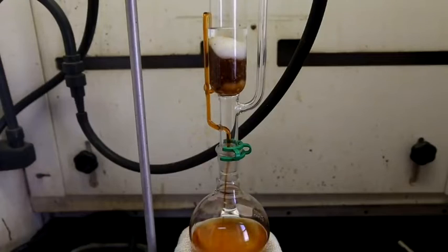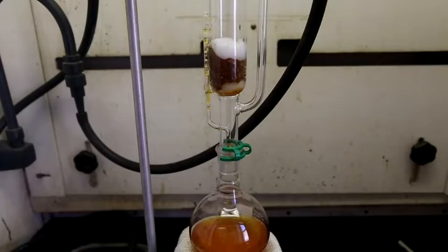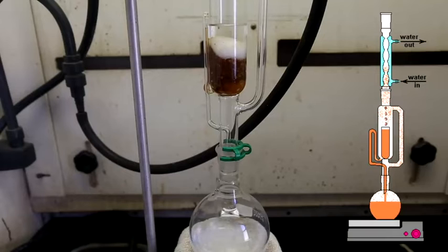The side arm is stacked with glass wool or normal wool. The solvent is heated using the isomantle and will begin to evaporate, moving through the apparatus to the condenser. The condensate then drips into the reservoir containing the thimble. Once the level of solvent reaches the siphon, it pours back into the flask and the cycle begins again.